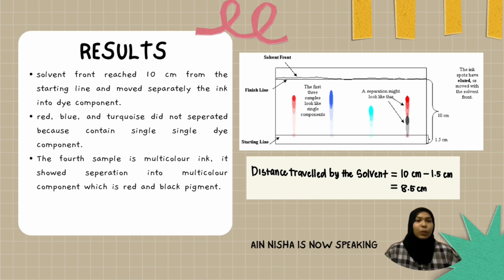This is why the blue color has higher solubility in the mobile phase and a weaker attraction to the stationary phase. Also, it has a stronger affinity with the mobile phase, allowing it to move more easily and travel a greater distance, followed by red, turquoise, and black.